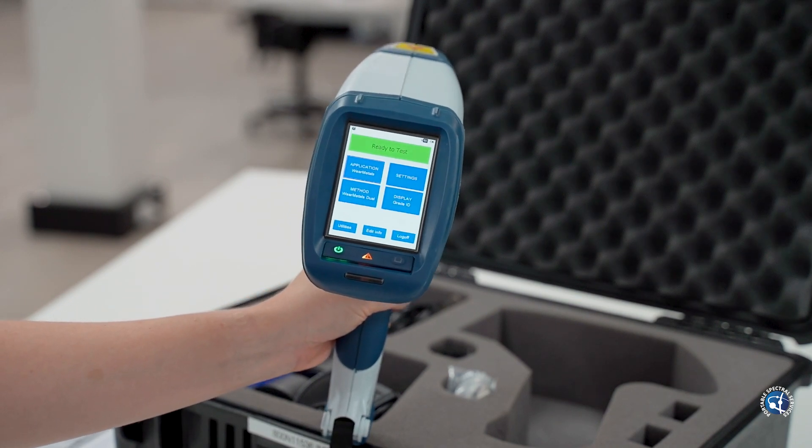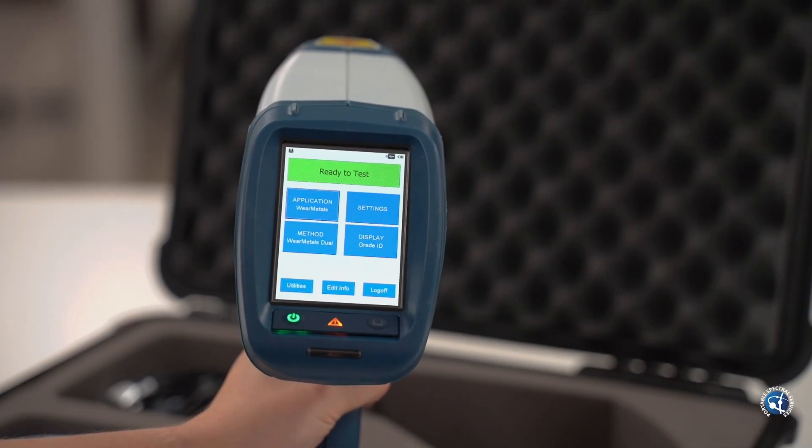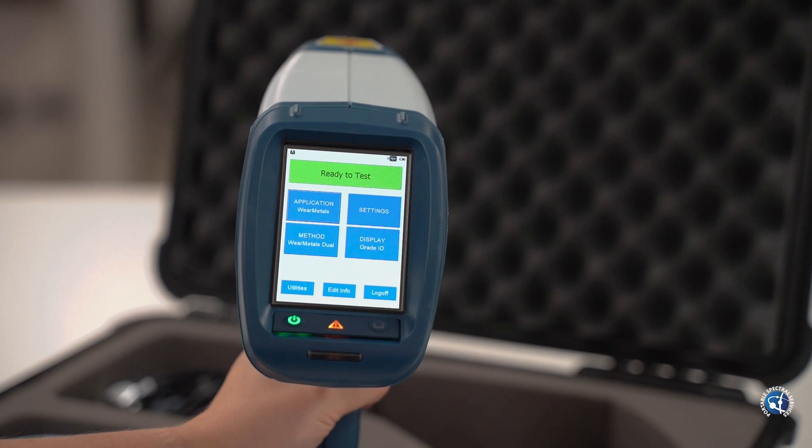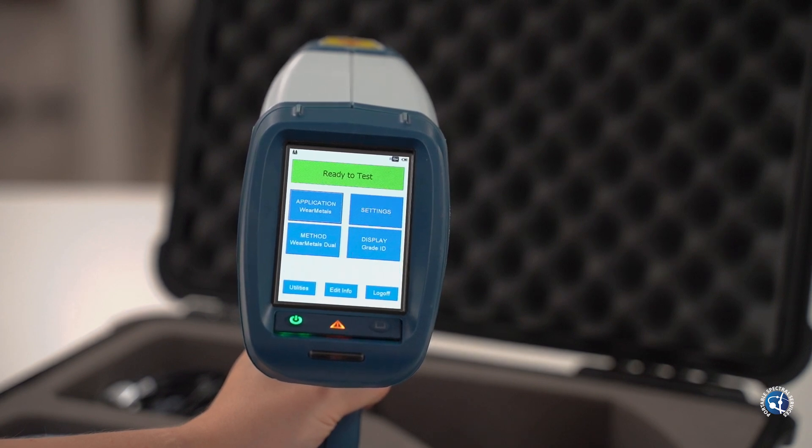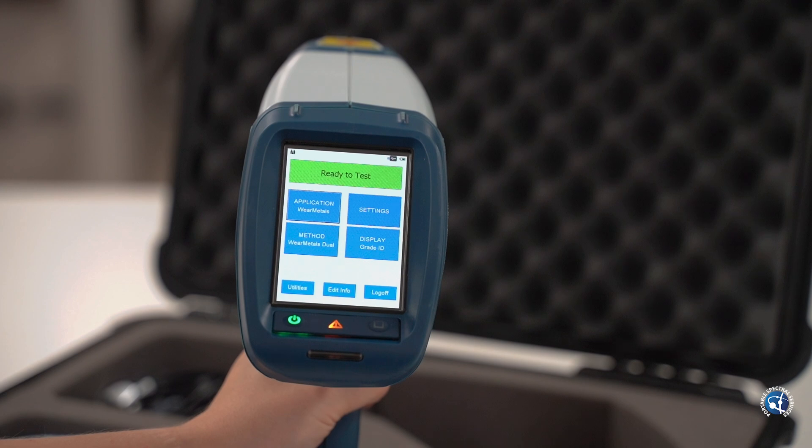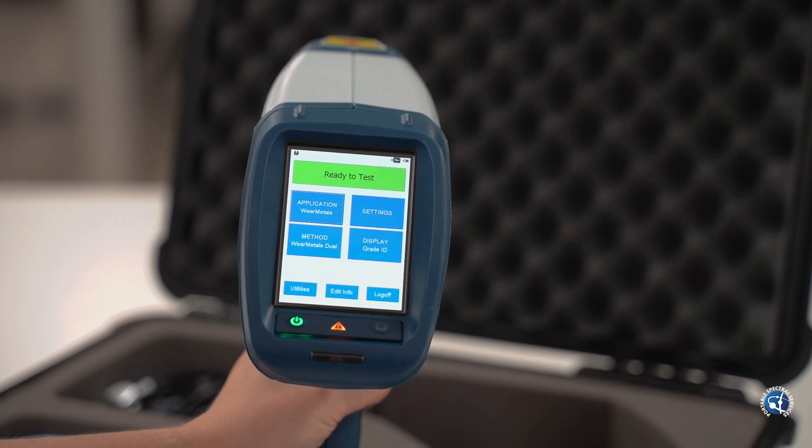The next step is to prepare for analysis. Depending on the sample type you are analyzing will depend on the calibration you choose. For example, if you are analyzing a geological material, you might choose geo-exploration as your calibration.